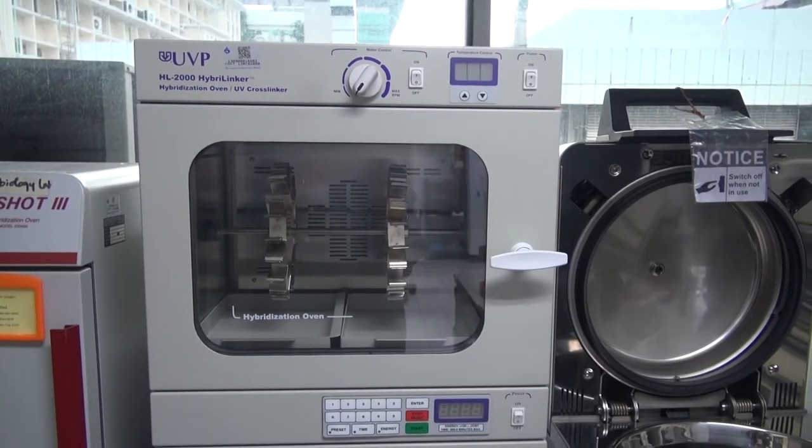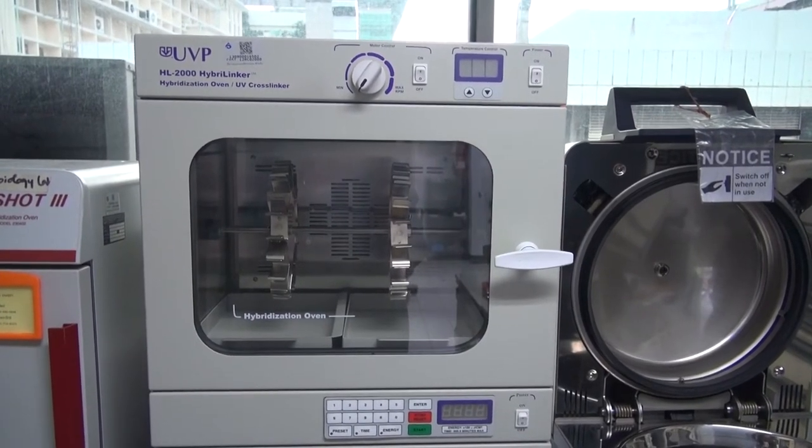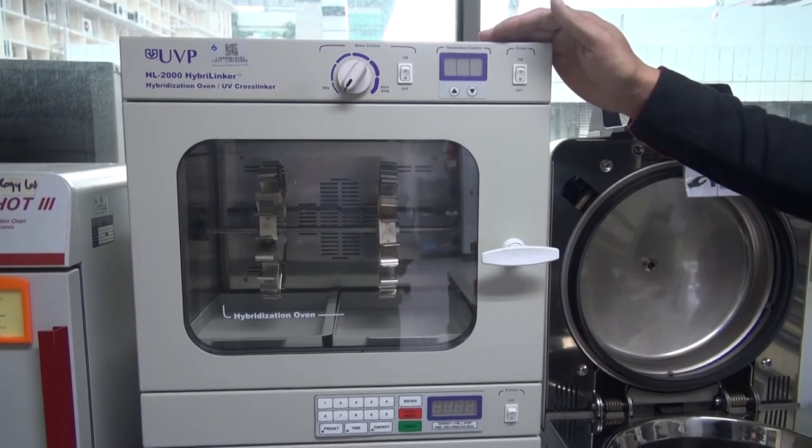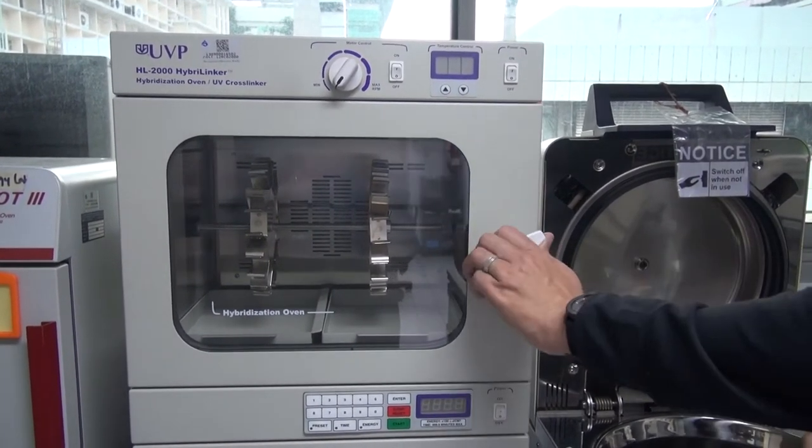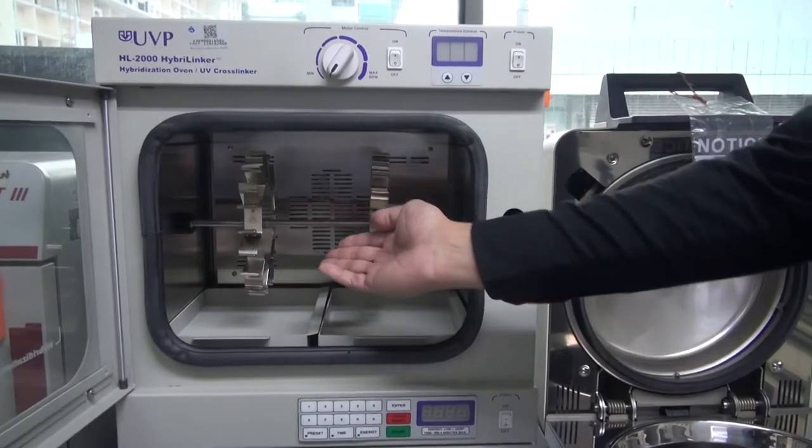Now let me demonstrate how to operate the hybridization oven, the upper unit. The oven is equipped with the bottle carousel holder as shown here.